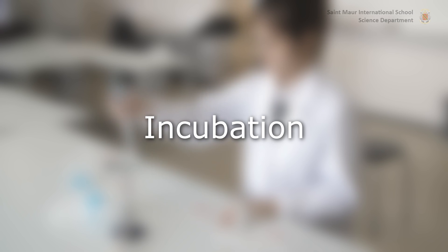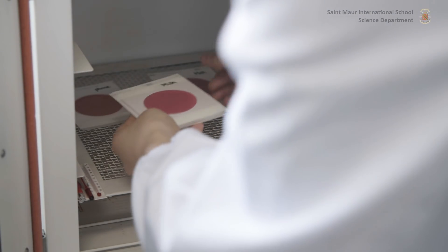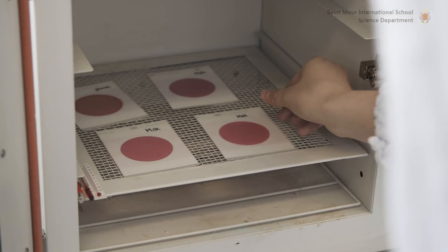Incubation: Petrifilms for coliform counts are incubated at 37 degrees for 24 hours, front cover facing upwards.